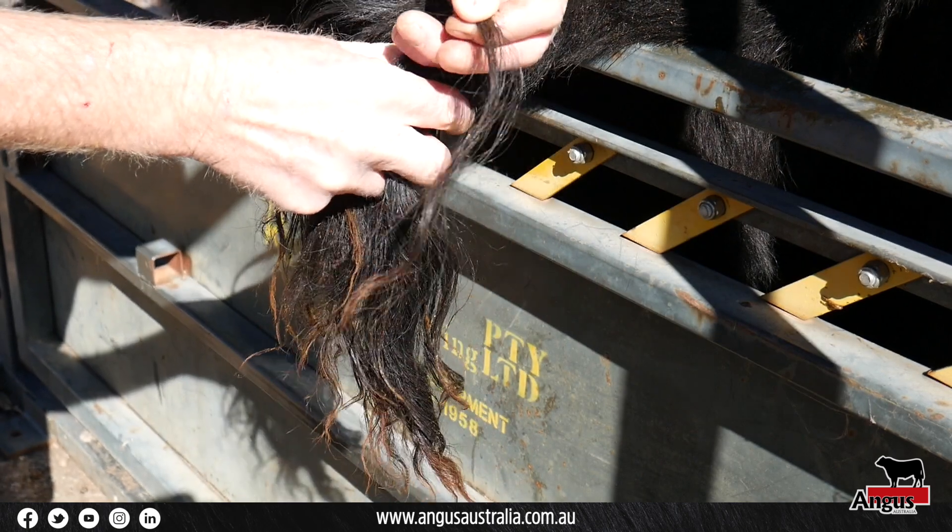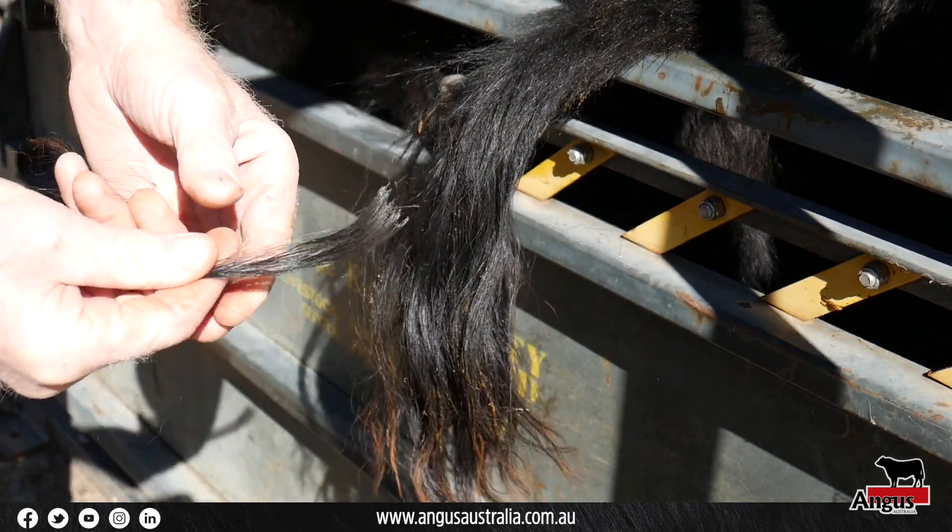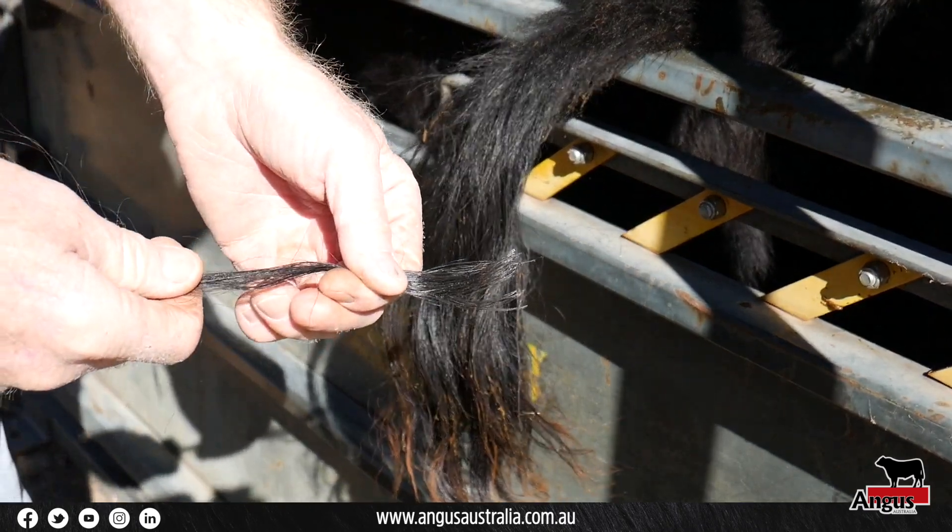Ensure follicles are present on the hair removed. It is essential that the follicles at the base of the tail hair strands are clean and dry.